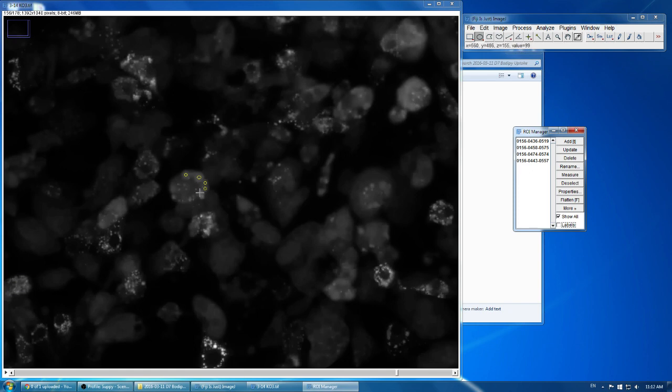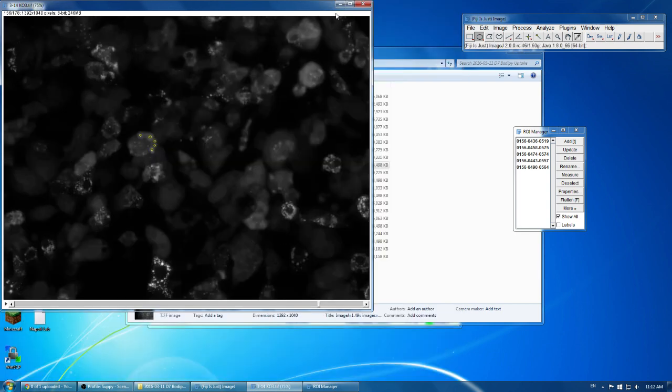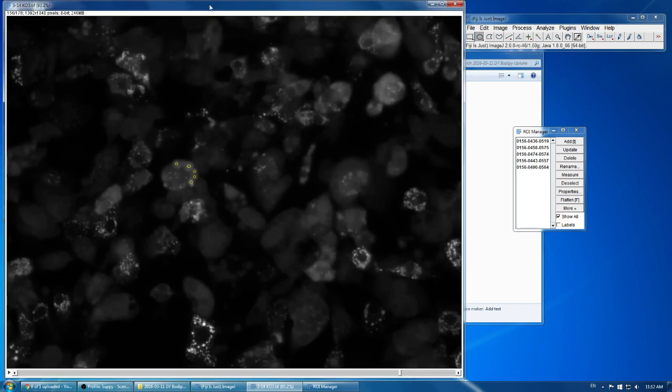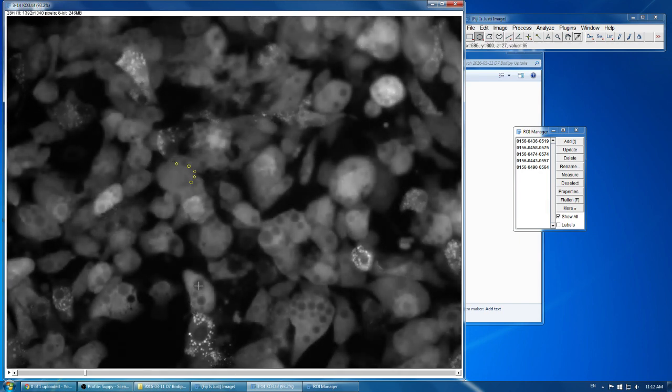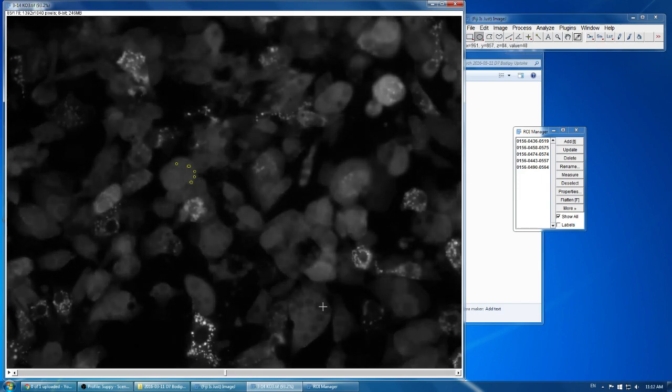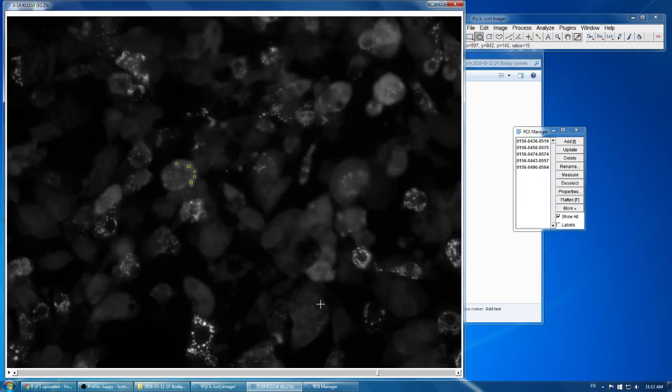And for the purpose of this video, I'm just going to be measuring a few places, even if they're not the most accurate lipid droplets that we're looking for. Let's just get 5 more. So I'm looking at right here, there's 2 droplets, there's like 5 right here, there's a bunch right here. And you can kind of still see them, but they're pretty faint.